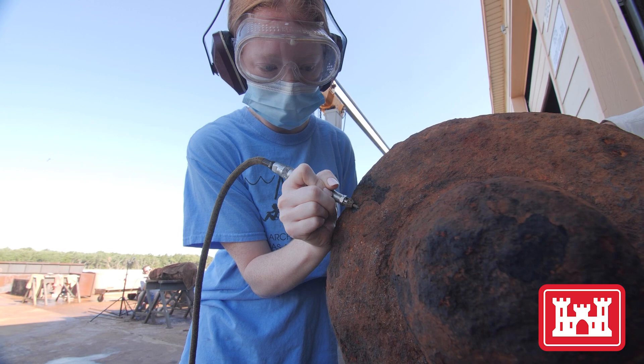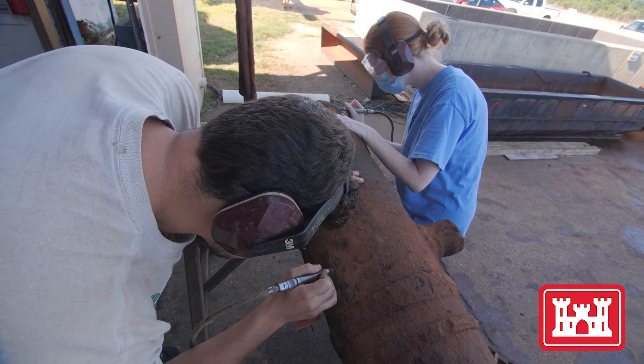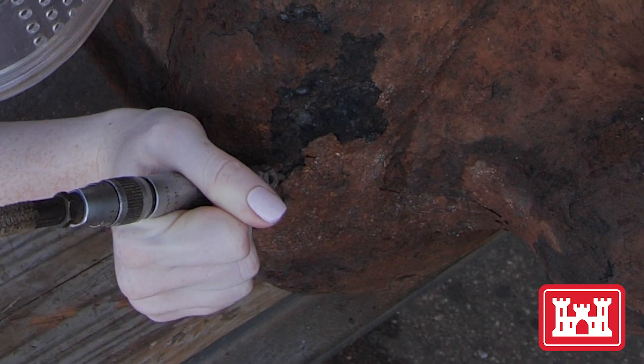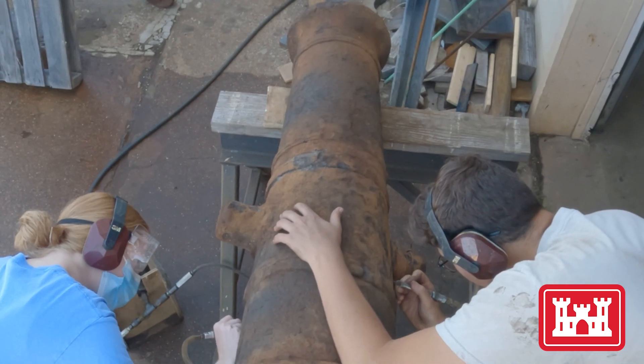Elsewhere in the lab, archaeology grad student Alyssa Carpenter and a colleague use a noisy pneumatic device called an air scribe to chisel away things that have stuck onto the outside of the cannon during the centuries submerged in the dark, salty water. It's a really crazy feeling because when you get a cannon that hasn't been worked on, there are mud globs over it. There's a lot of mollusks and biological activity. When we're scraping it with an air scribe or with a hammer and you hit the surface, it's a crazy feeling because you're the first one to see the surface. We just keep doing that and we have no idea what we're going to find. It's dirty, smelly work from beginning to end.